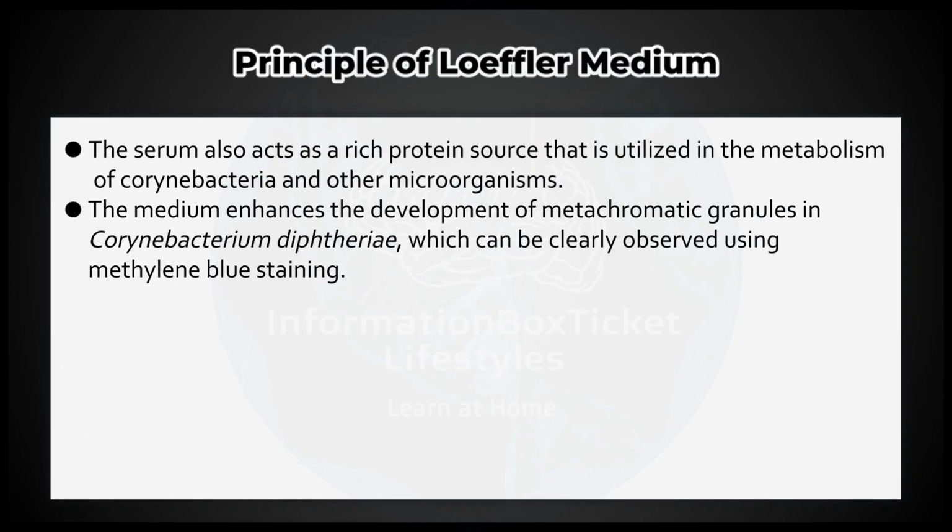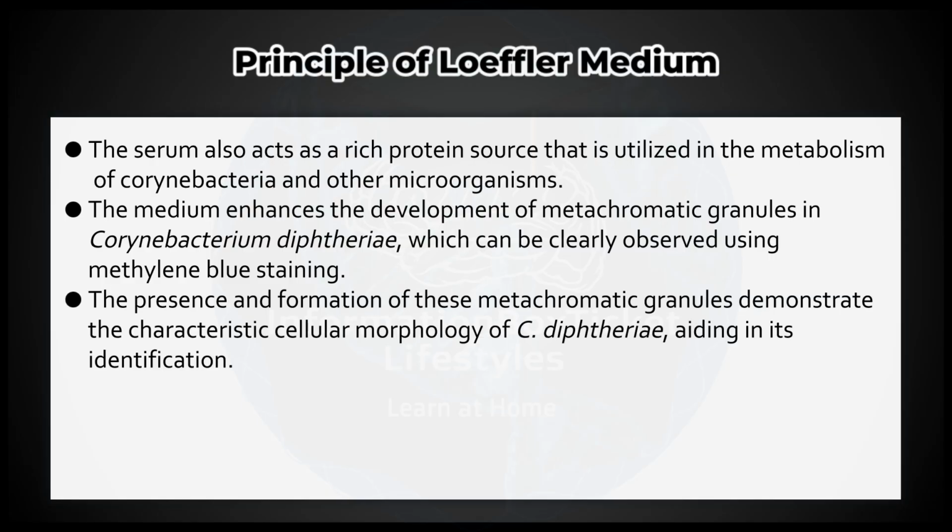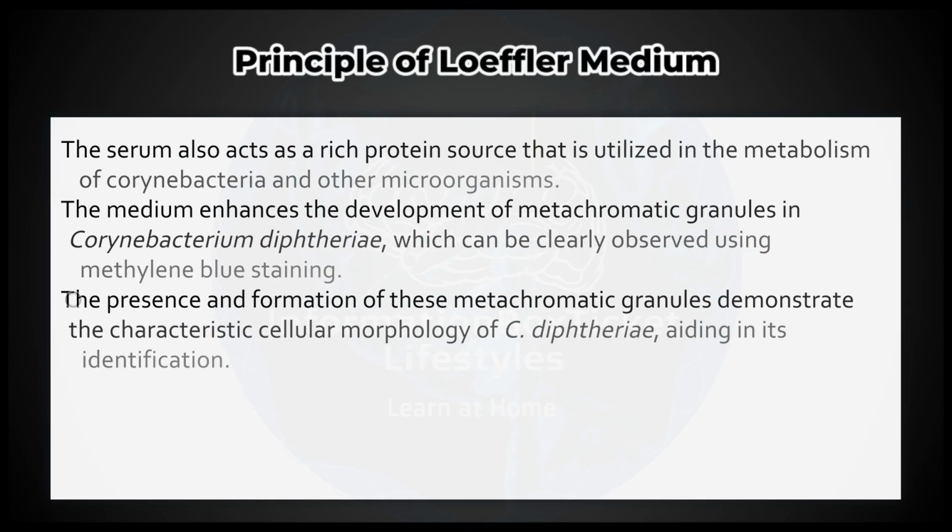The medium enhances the development of metachromatic granules in Corynebacterium diphtheriae, which can be clearly observed using methylene blue staining. The presence and formation of these metachromatic granules demonstrate the characteristic cellular morphology of C. diphtheriae, aiding in its identification.